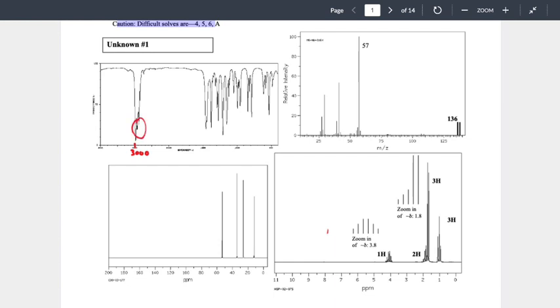What I'm referencing is that group of peaks. That group of peaks is now what I'm going to try to match to common peak patterning for the types of bonds, because what we identified outside of this recording was that IR references bonds. So what kind of bond produces that kind of peak patterning?